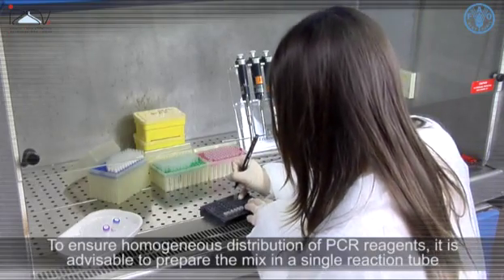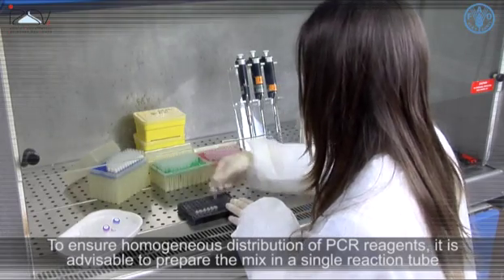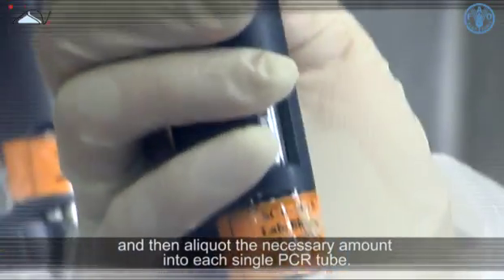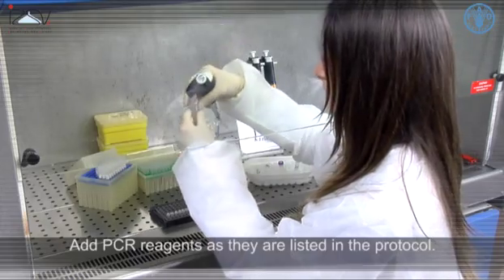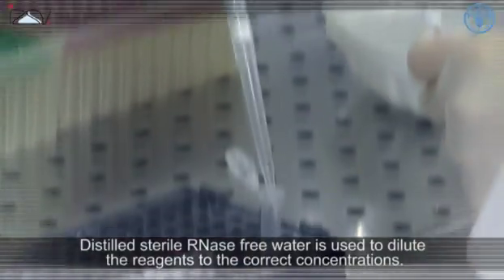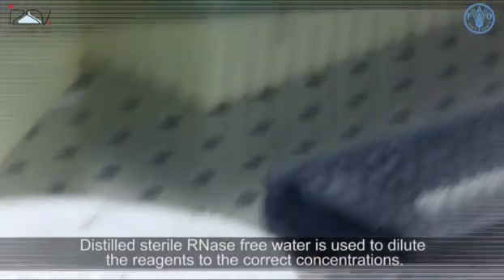To ensure homogeneous distribution of PCR reagents, it is advisable to prepare the mix in a single reaction tube and then aliquot the necessary amount into each single PCR tube. Add PCR reagents as they are listed in the protocol. Distilled sterile RNase-free water is used to dilute the reagents to the correct concentrations.